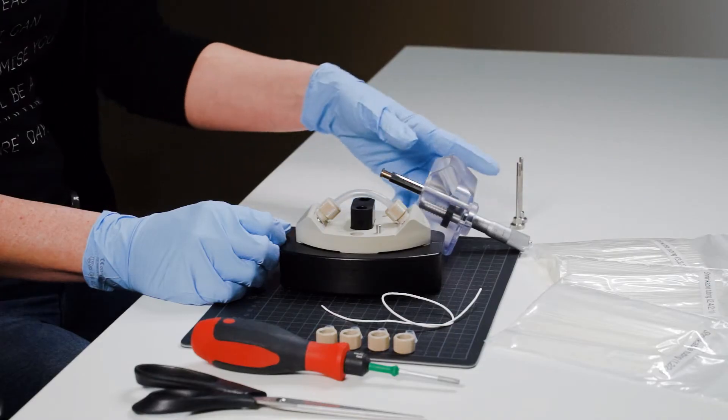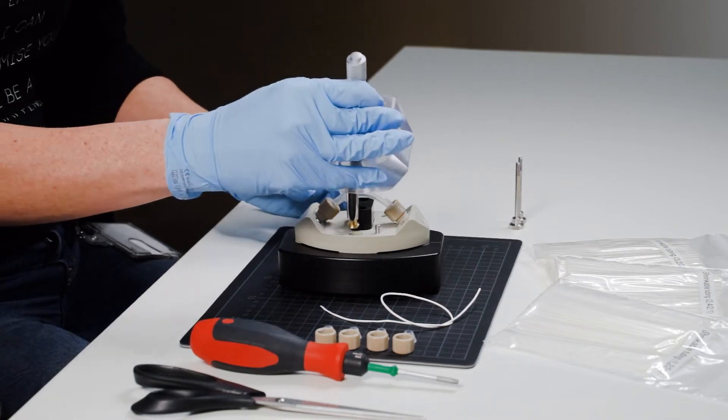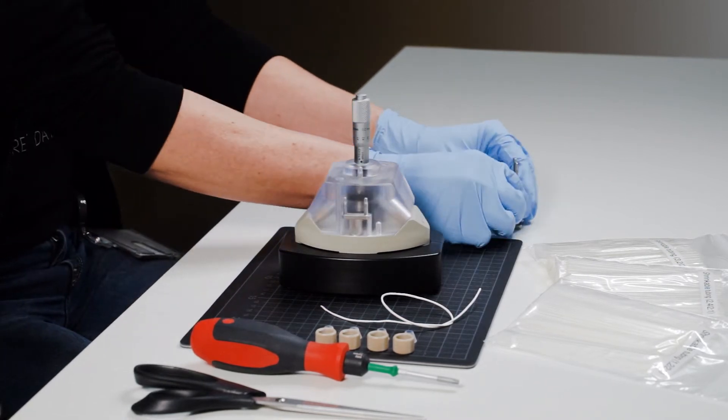Put the upper part of the measuring cell for flexible tubing on the lower part of the cell and fix the two parts with the screws.